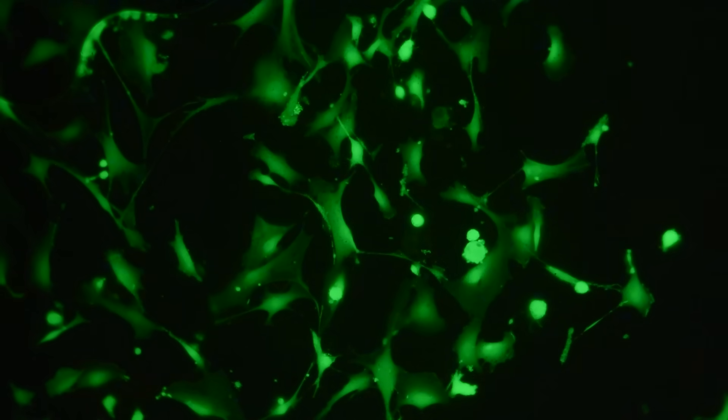Just for comparison, here's cells grown normally on a flat surface. See how they're all basically in focus and flat? Compare that to the meat leaf, where even the shape of the cells is a little bit different as they contour to the shape of the cellulose. And for those wondering, this is what a blank leaf looked like. A very, very slight glow, but nothing compared to the meat leaf.